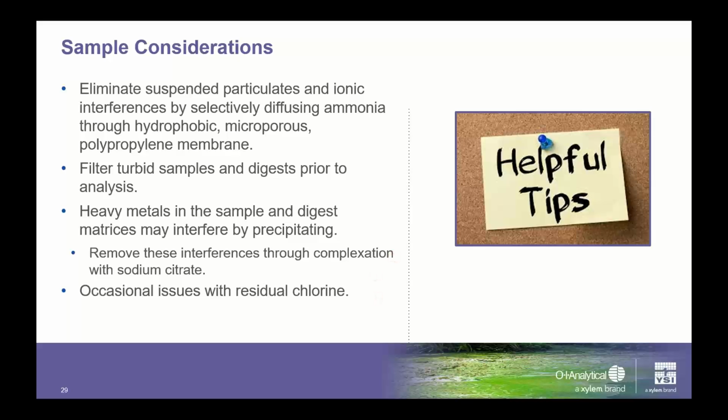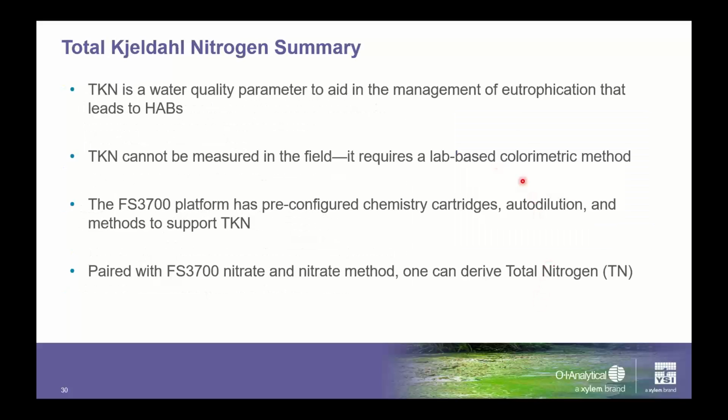So that brings us to the close of our TKN part of the presentation. Just to remind you, the reason we're measuring TKN is because it's very important to understand eutrophication that stimulates harmful algal blooms. And you cannot measure TKN with an instrument in the field like a sonde. You have to measure it with a colorimetric method.